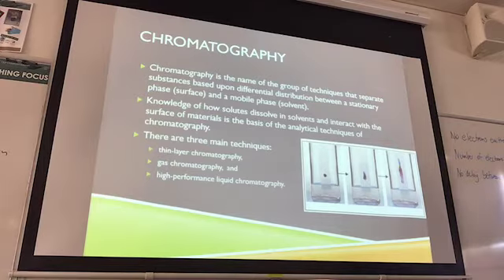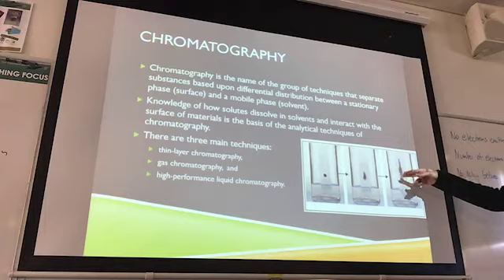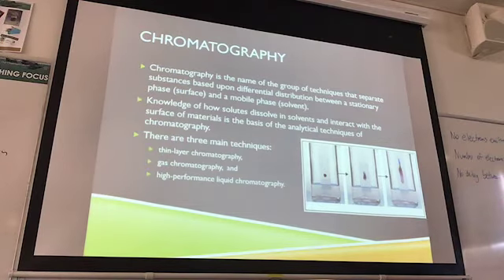So chromatography is the technique where we separate out the different components of a mixture, and we separate it out as a result of differential distribution between the stationary phase and the mobile phase. So the stationary phase, in what you would have done previously, would be the filter paper, and the mobile phase will be the solvent.